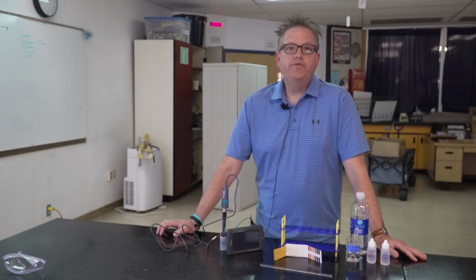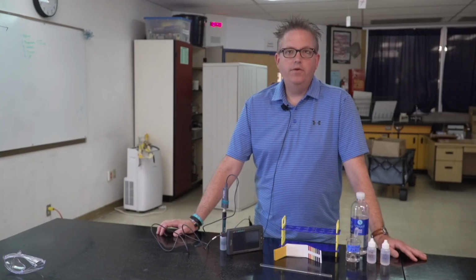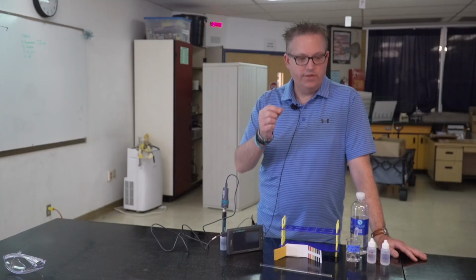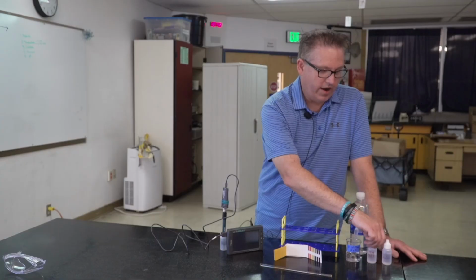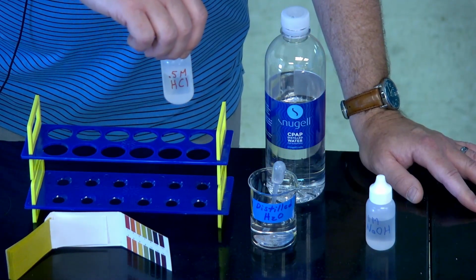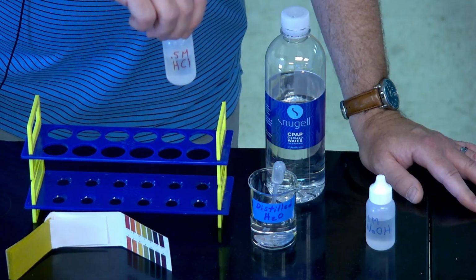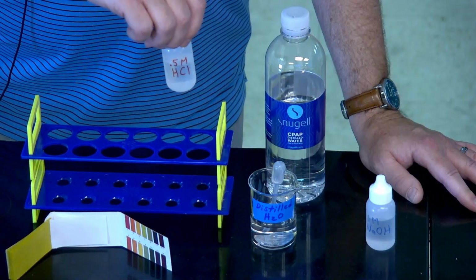So for the pH variable in the enzyme investigation, what we do to create a range of different pHs in each of the test tubes is, in order to create an acidic environment, we will use varying amounts of hydrochloric acid, and we do that by adding a certain number of drops to each of the test tubes that we want to create an acid environment in.